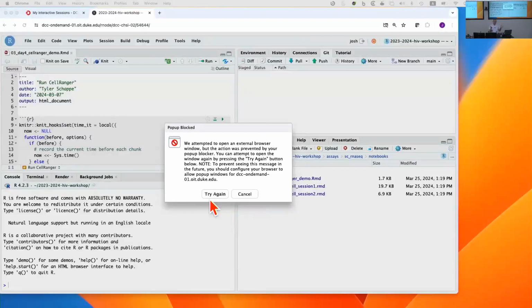The other reason UMIs can be used is to improve the accuracy of sequencing. You can collapse reads into UMIs and either take a consensus of the sequence of those multiple reads, or there are a couple of other approaches, to use that multiple measurement information to improve the sequence quality or the sequencing accuracy.